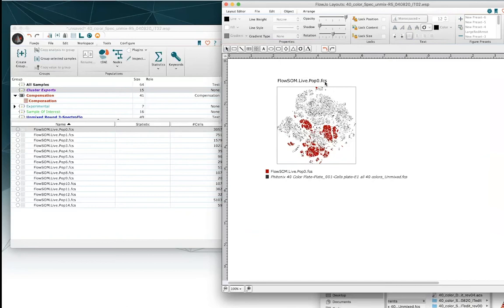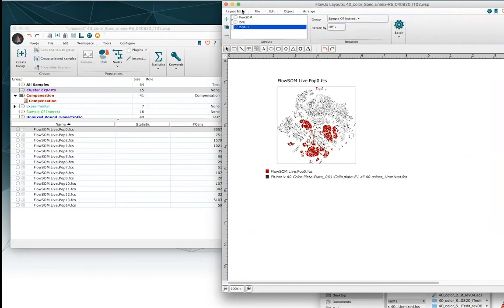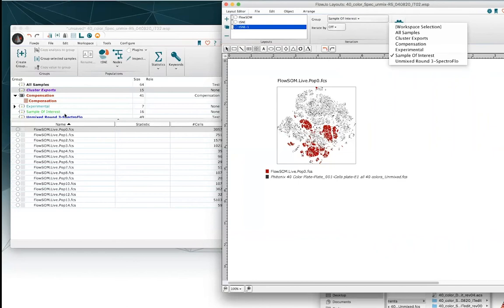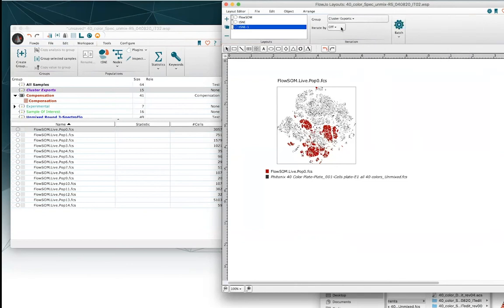Now we need to think about the actual batching as a last step. Go back to the layout editor tab and make sure that the batching is set correctly. Currently, we're set to batch across a group in the iteration section, and that group is usually going to be whatever group you have selected in the workspace. Here it seems to have gotten set to sample of interest, which is a group that contains one single population. So I actually want to switch to my cluster exports. That's telling the layout editor: I want you to bring in samples from the cluster exports, which is going to be our FlowSOM clusters alone.